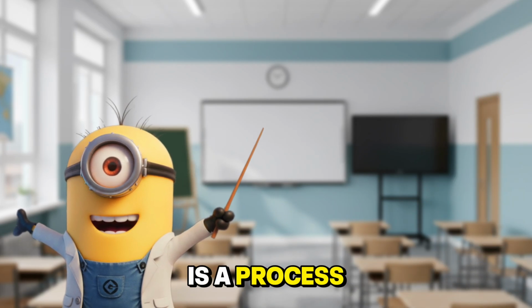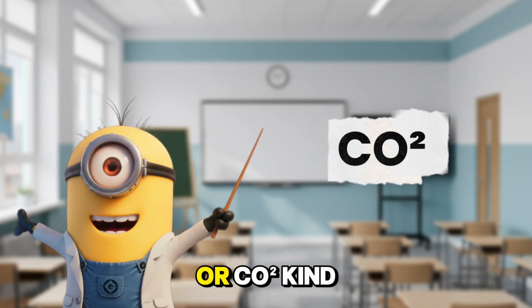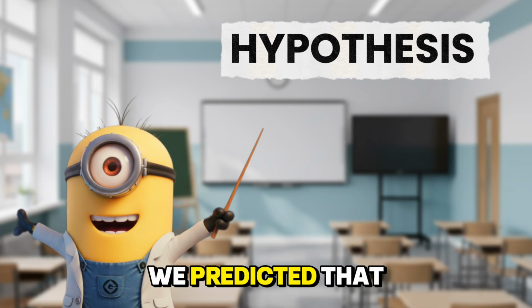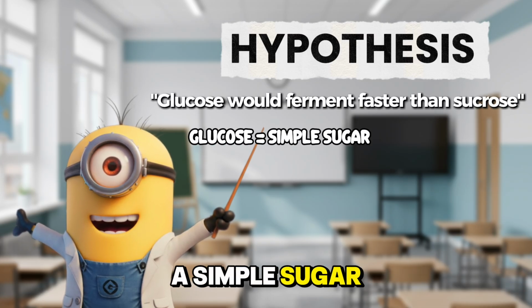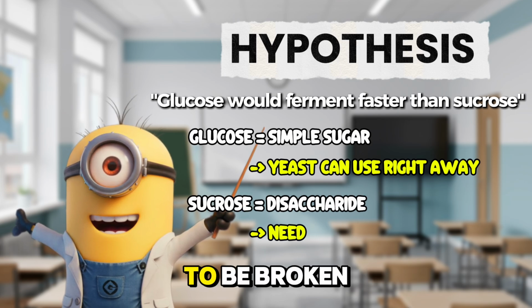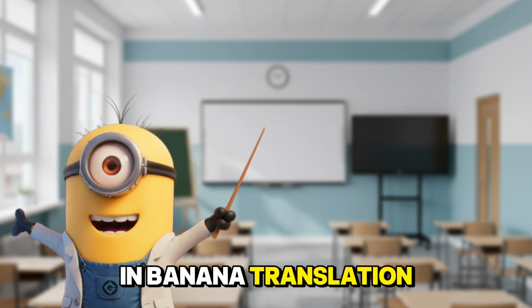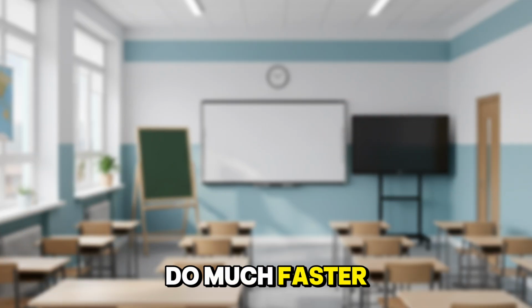Fermentation is a process where yeast break down sugar without oxygen and release carbon dioxide gas, or CO2, kind of like tiny yeast burps. For our hypothesis, we predicted that glucose would ferment faster than sucrose, because glucose is a simple sugar that yeast can use right away. Sucrose, on the other hand, is a disaccharide, so it needs to be broken down first before yeast can use it. So, in banana translation, we expected glucose to make the yeast go be-do much faster.